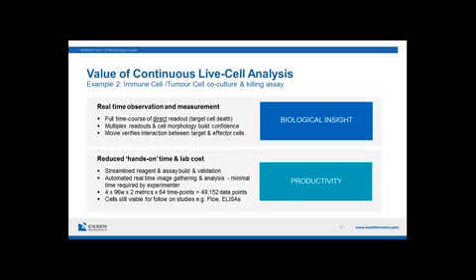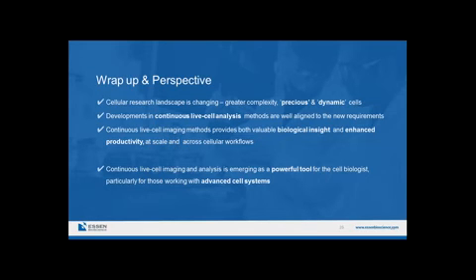And again, in similar ways to that which I showed you before, the cells remain viable throughout the experiment for follow-on studies, so you could lift them to do flow cytometry analysis, or you could sample supernatants to measure cytokines, for example using ELISAs. Okay, so that's the story.